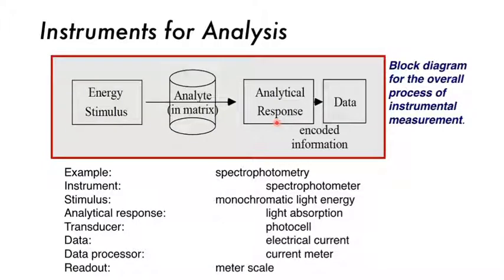We're not actually measuring the light in any meaningful way. We're indirectly measuring the light through its interaction with the photocell, which produces an electrical signal from that light, because measuring the light itself is pretty hard to do. It's much easier to get an electrical signal, which we can measure very well. We're very good, as humans, at manipulating electricity.